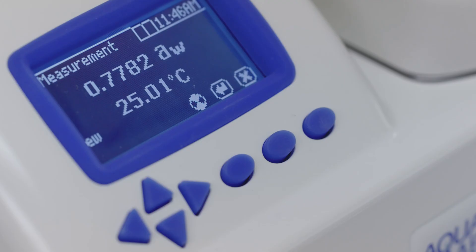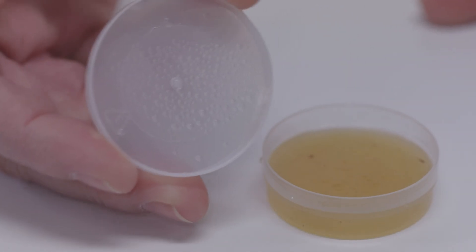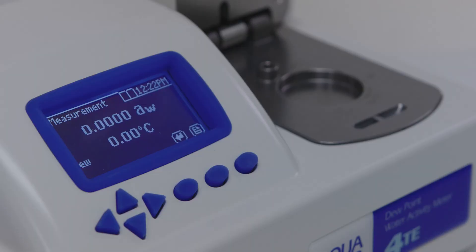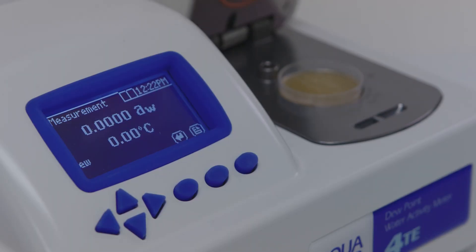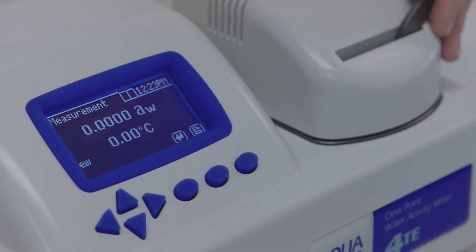Three: your sample temperature and block temperature need to be in the same general range before your reading can be taken. If it's too hot, water can condense on the inside of the sensor chamber. This ruins your water activity readings. If your sample is too hot or too cold, the instrument will ask you to take the sample out. If the temperature is only off by a few degrees, the instrument will wait as the sample comes to temperature.